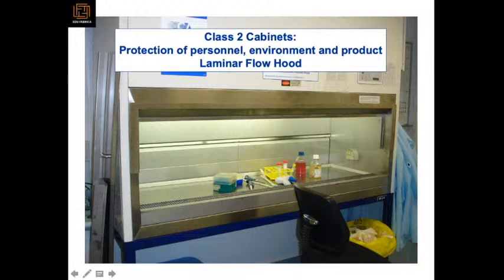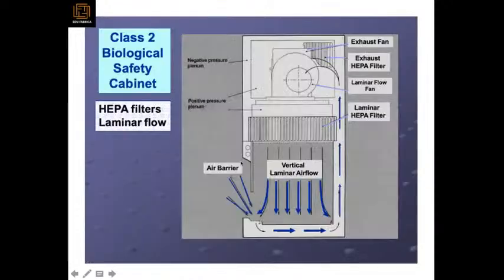And here is the lab coat hanging on the right hand side. And here in the yellow bag, all paper waste is thrown. And in the blue one, you throw the organic cell culture waste. So waste has to be also segregated separately. There are some plugs also in order to charge your pipettes. This is called a pipette boy, to remove the media and work with it. So things need to be very much sterile when you're working.